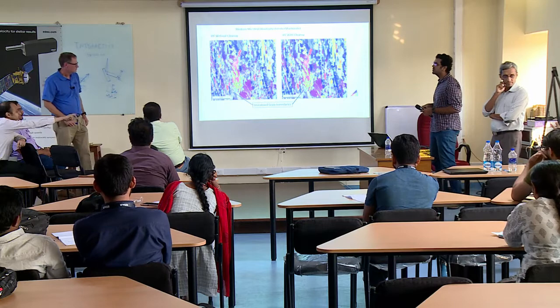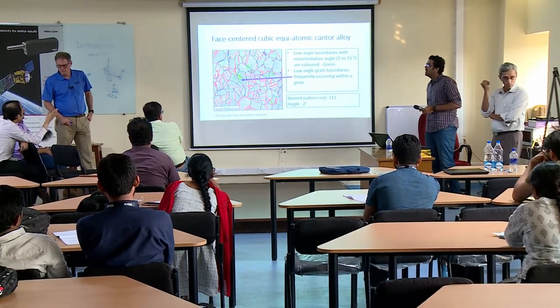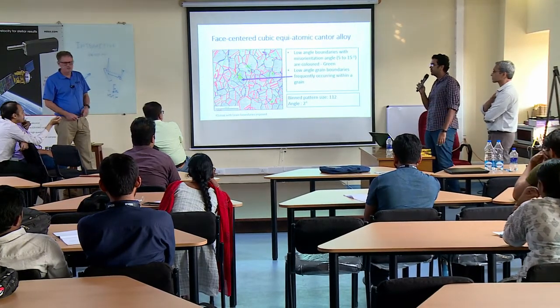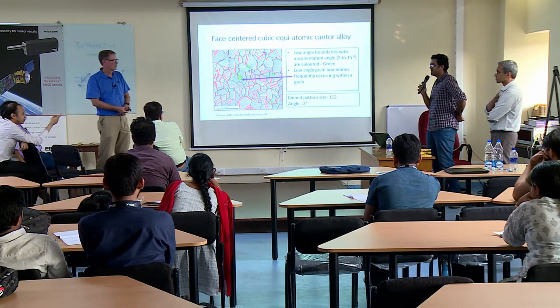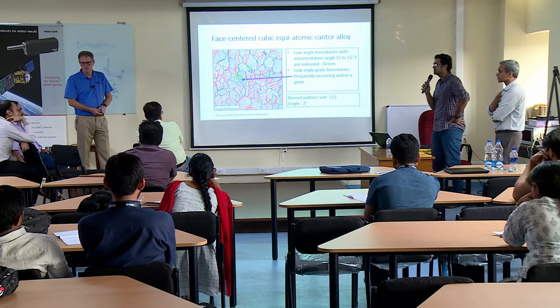Can you just go back to the, this is not a normal alloy, it is Cantor alloy, it contains 5 elements in equal proportion. But this problem we see in nickel, pure nickel, also. Yeah, I've seen it myself in just pure, simple. If you do EDS, Cantor alloy, like this is single phase. No, single phase, yeah, is fine, but you would see interesting things.